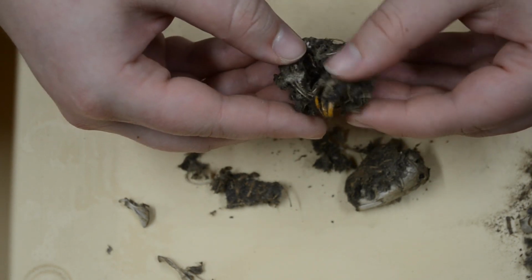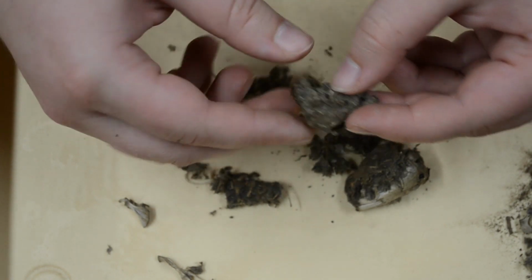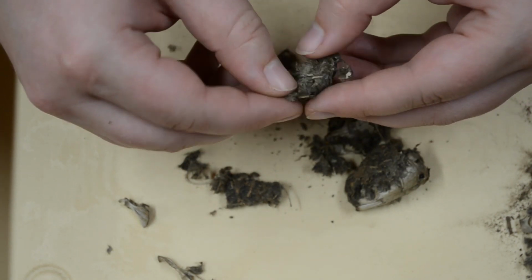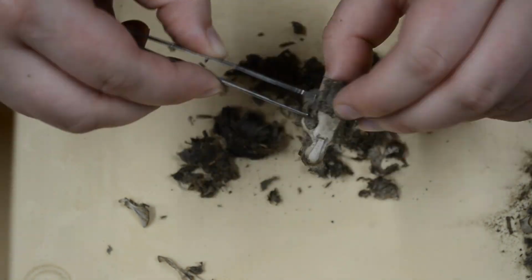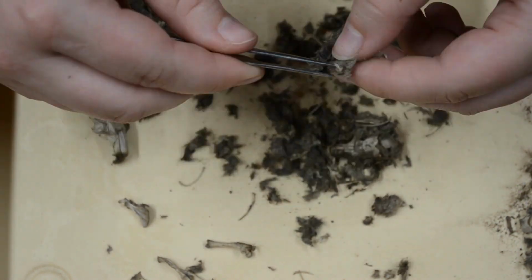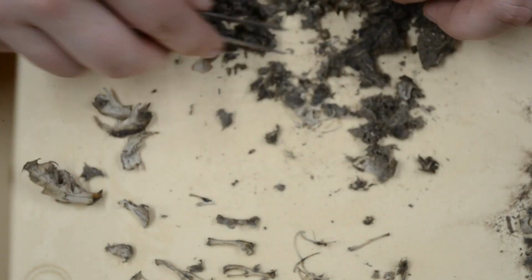It may seem like the regurgitated pellet would be smelly or messy, but since they are completely dry, they have no smell to them at all, and they're dry to the touch. And so once you can get past that, breaking apart your pellet can be really fun. The owl pellets we receive from Carolina Biological Supply are heat sterilized at 250 degrees Fahrenheit for 4 hours, then cooled in the oven. They are free of chemicals.